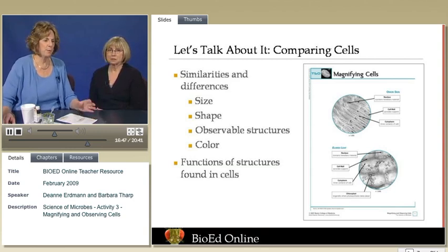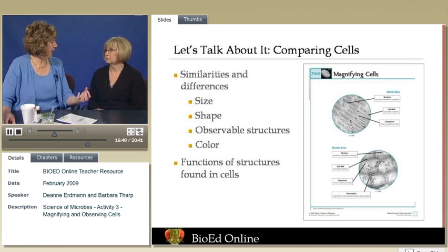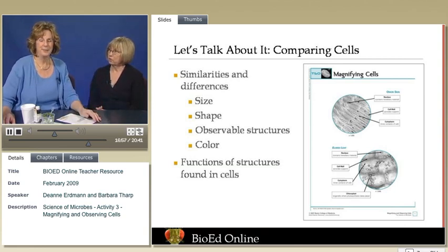I think so. And so that onion bulb, it's down below the dirt, the ground when it's growing. But have you ever seen the top of an onion? It's green. So I wonder if we ever looked at that, if we would see any chloroplast up there. I think we would. So we also saw a very clear nucleus in the onion cell, but they're not very visible in the Elodea, and part of the reason is that we didn't stain them.